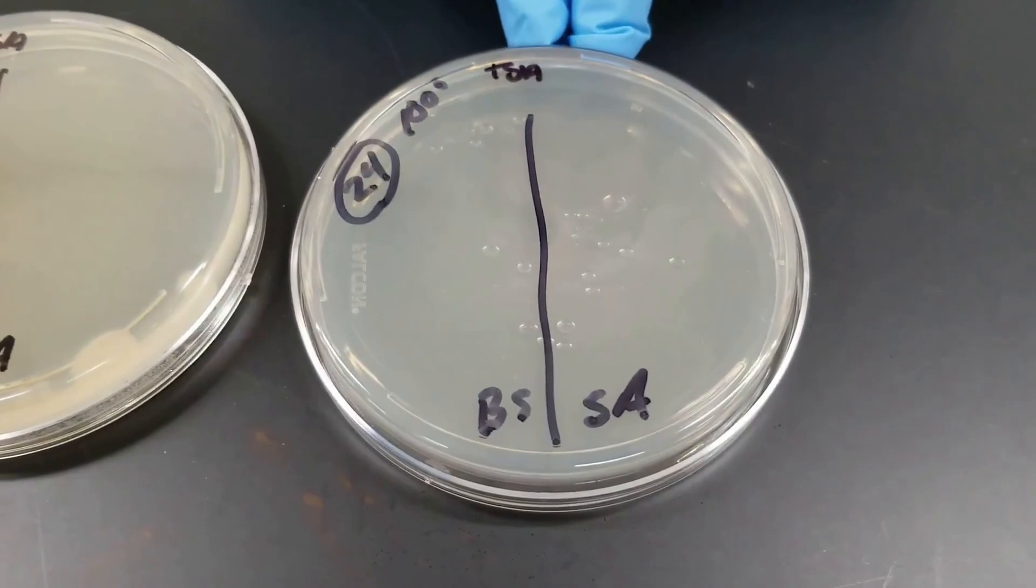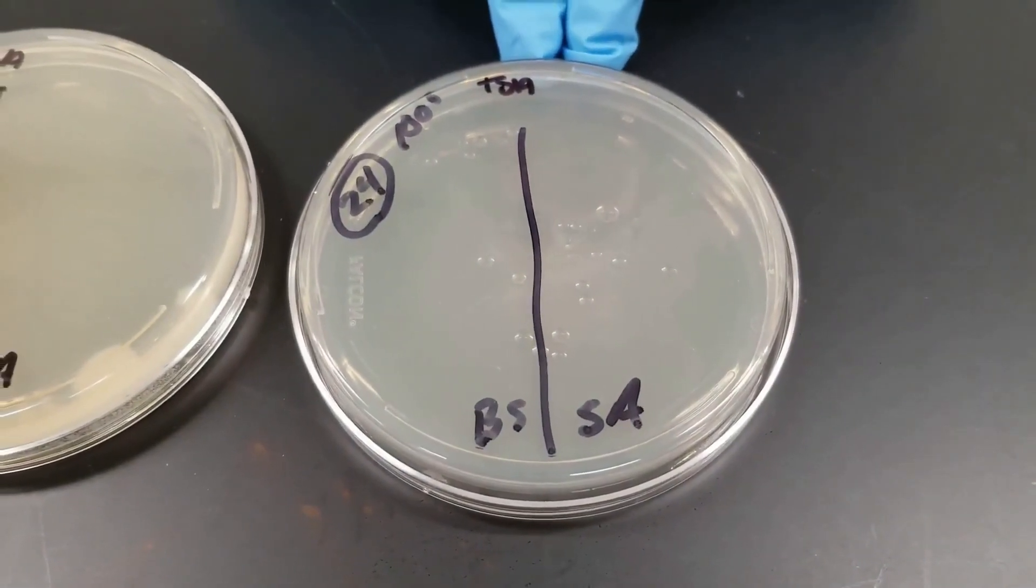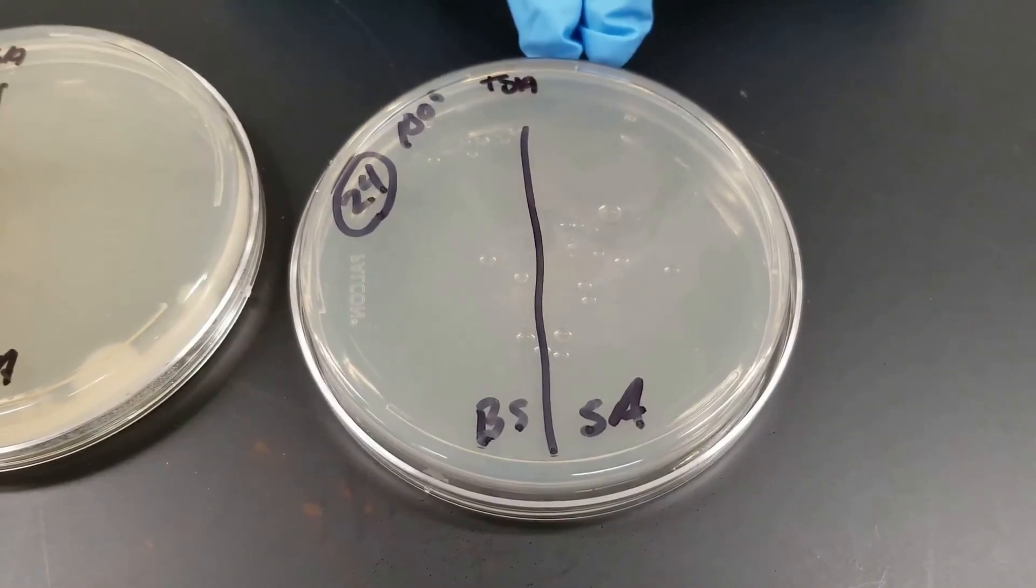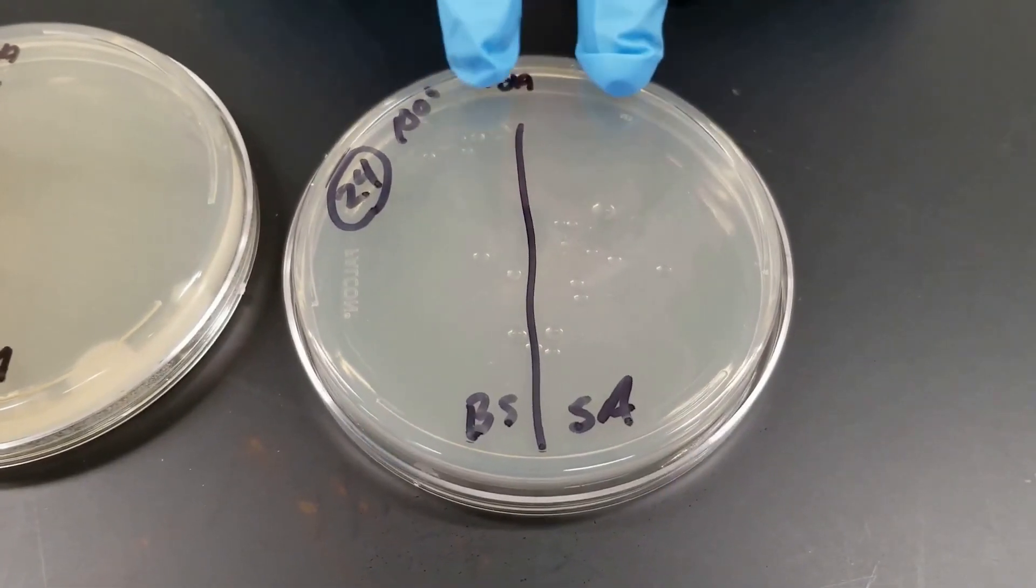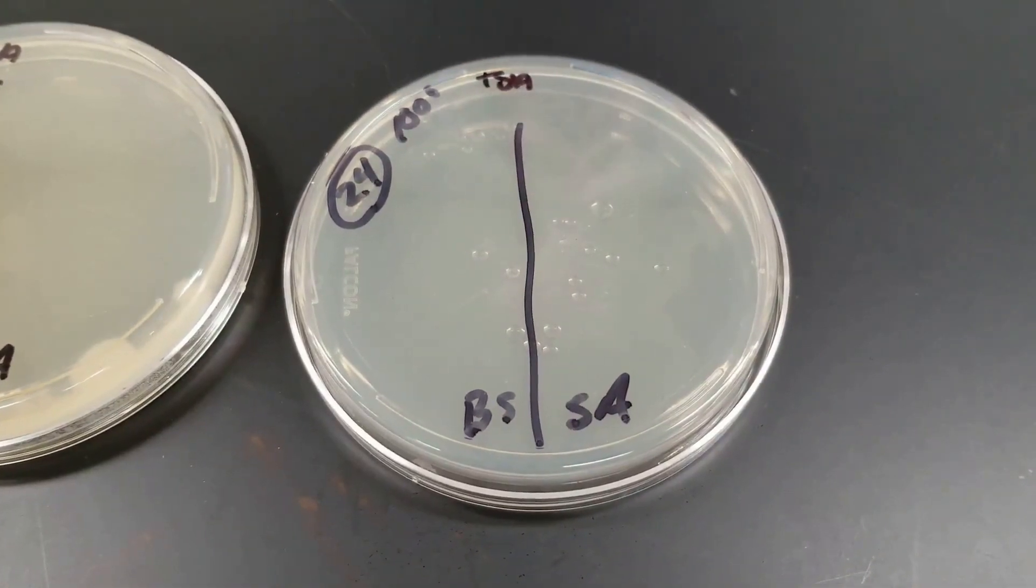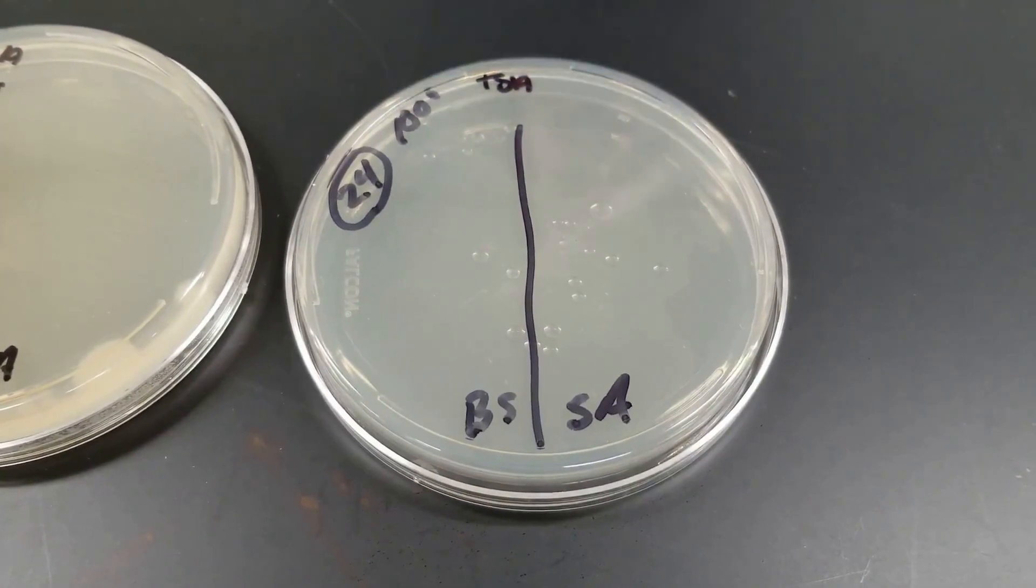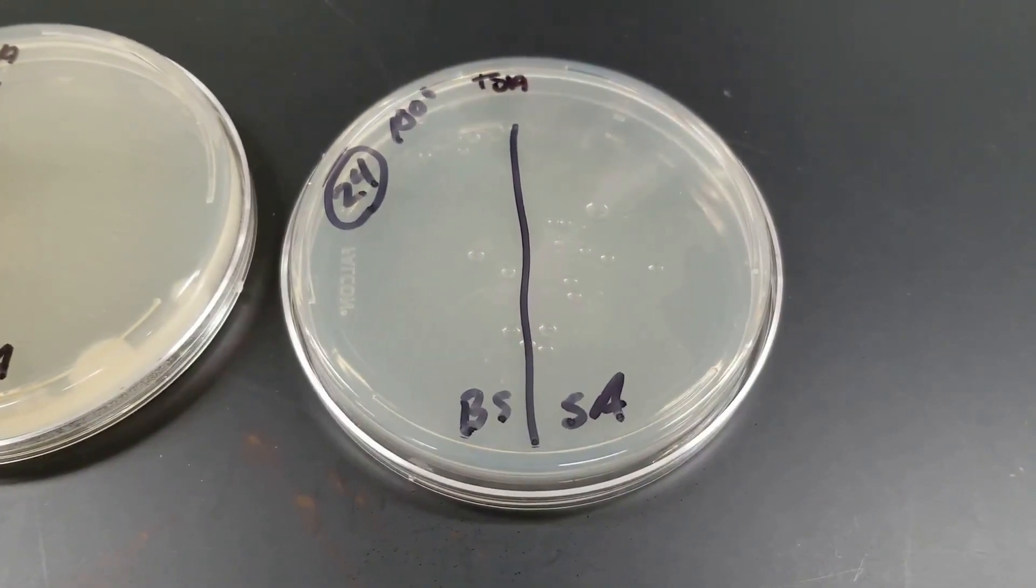This last plate, the culture was placed here at 100 degrees Celsius when water is boiling for 10 minutes. And as you can see, at this point now, both cultures were killed. So boiling for 10 minutes was effective at destroying even the endospores that Bacillus produced.